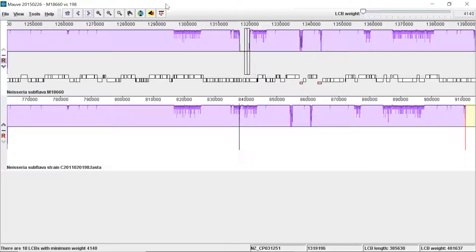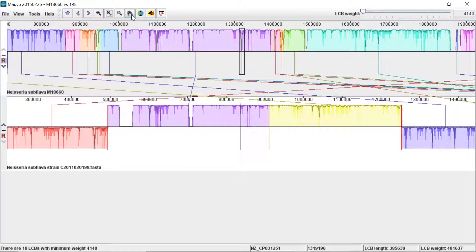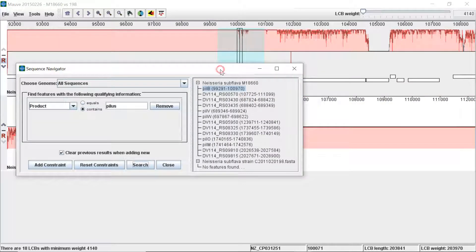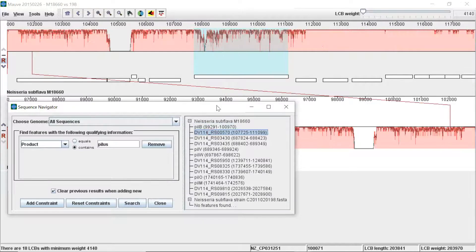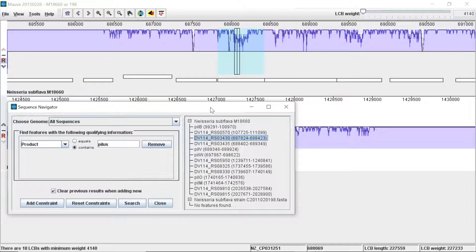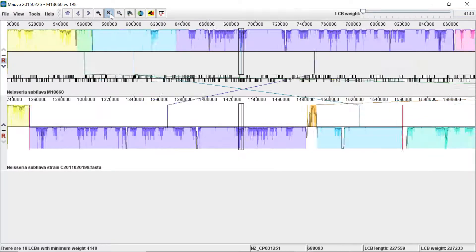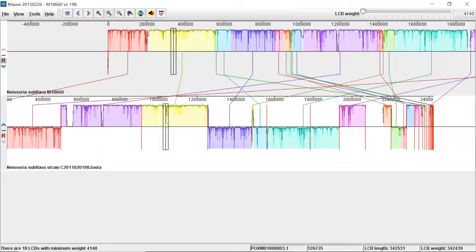Another option is to search the reference genome. Click on the binocular icon to find an annotation feature. Go into 'Product' and type the name of a gene — for example, 'pilus' — and search. You can see it brings up annotations associated with pilus, such as PilB and PilC according to the annotation. So you can look for the presence or absence of specific genes that way.